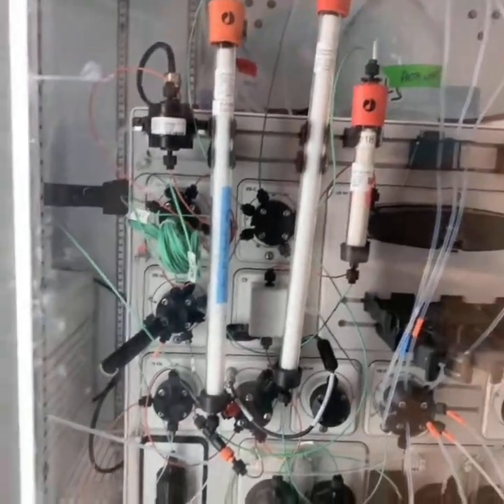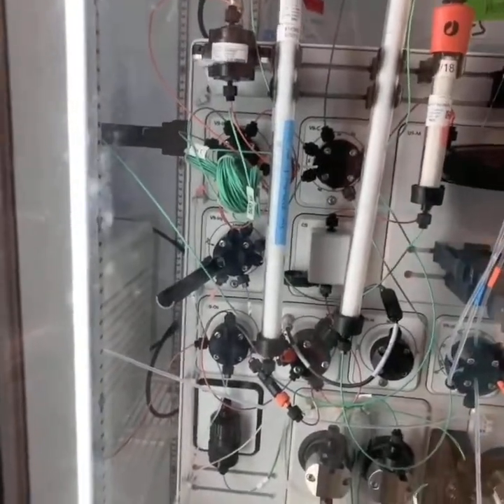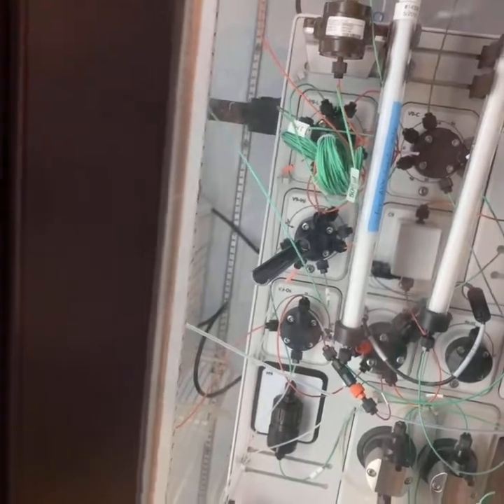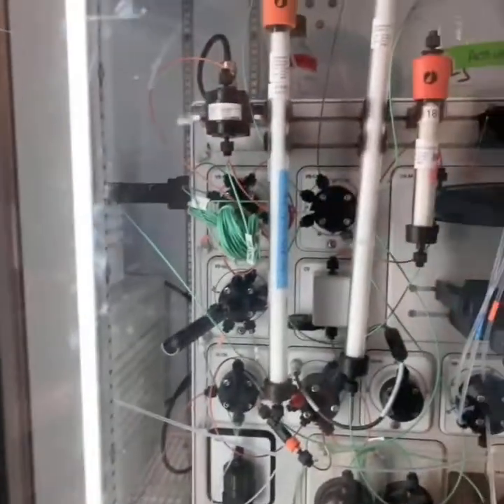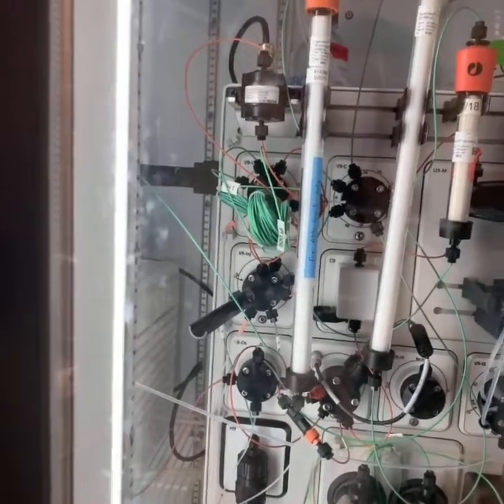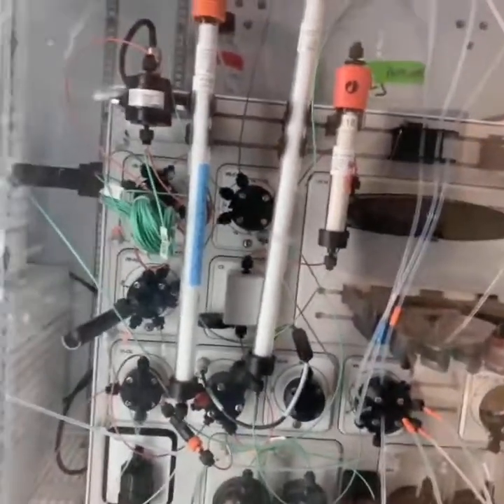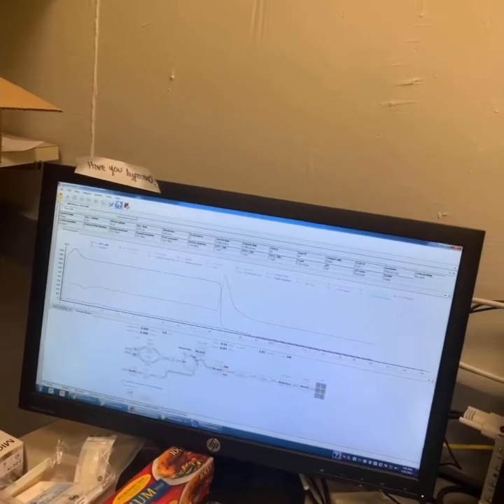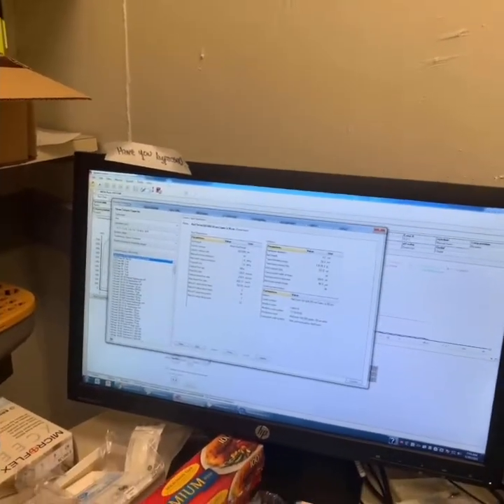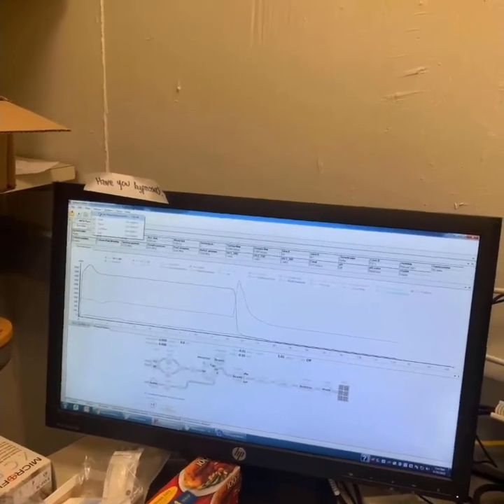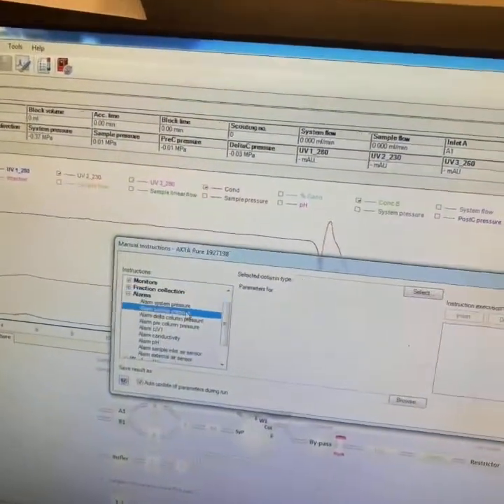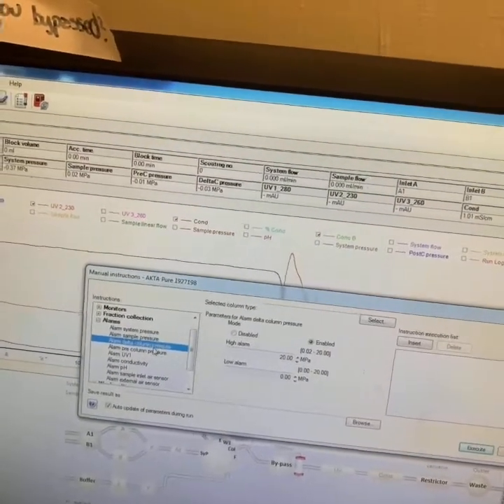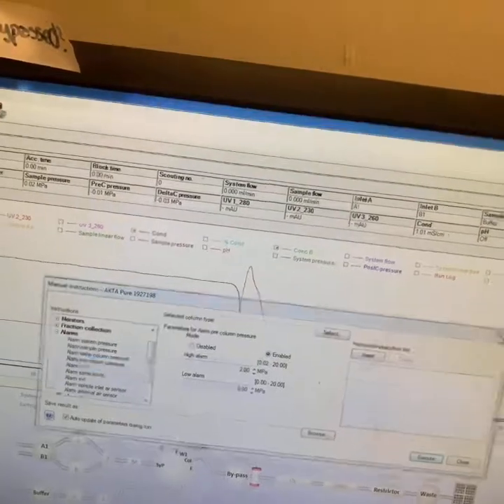I forgot to tell you about the pressure monitors. So there's a pressure monitor before it goes into the column and after it comes out of the column. So the pressure monitor before the column gives you the pre-column pressure. The pressure monitor after the column gives you the post-column pressure. And the difference between them is the delta column pressure. And so if you're using it manually you want to set the pressure limits. So each column has different pressure limits. And you can find these in the column handling function. And then if you go to manual, execute manual instructions, you can do alarms and set the pressures. So you can set pre-column and delta pressure. And that way the software will stop before you hurt your column.